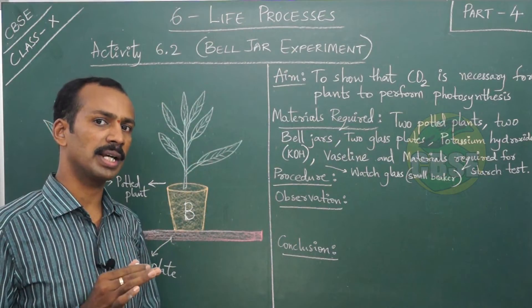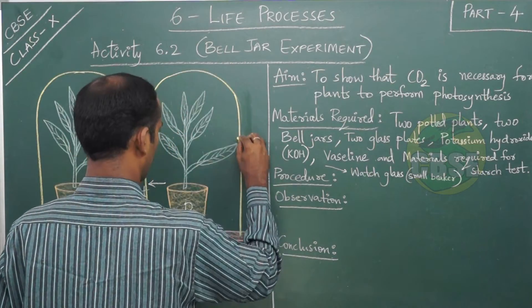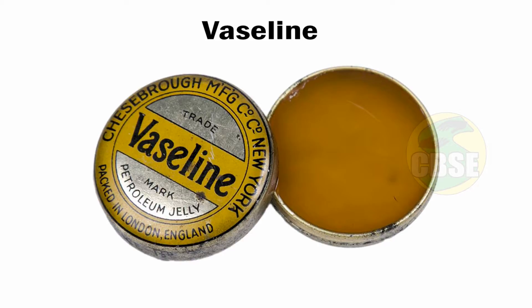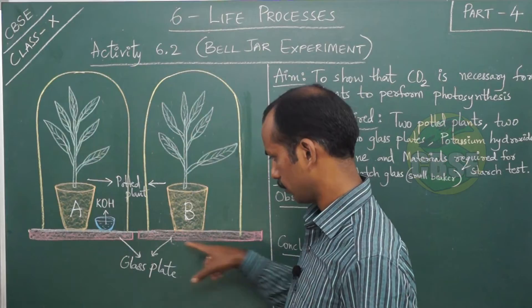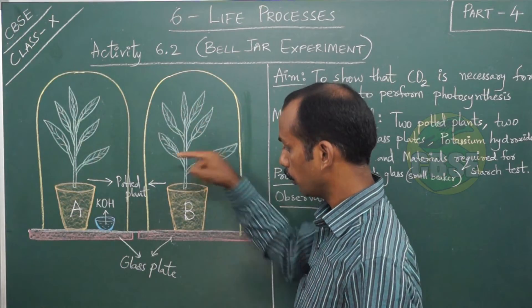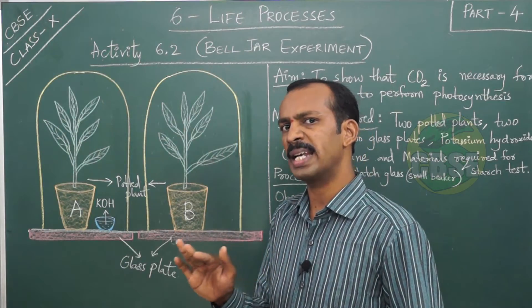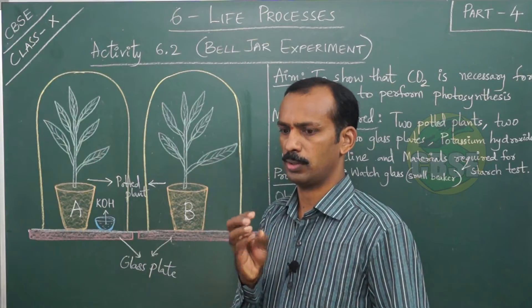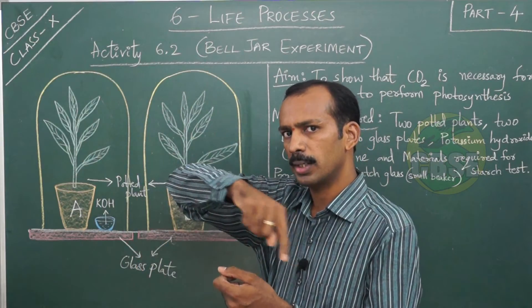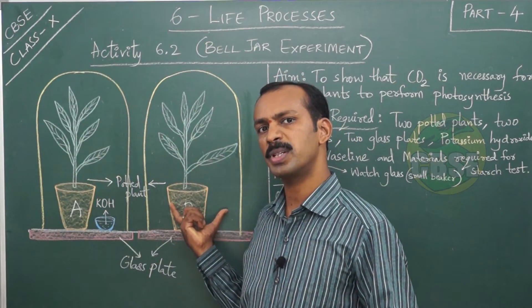We are covering bell jars on both the potted plants — bell jar A and bell jar B. We placed a glass plate under each potted plant. Between the bell jar and the glass plate there should not be any gap. A slight gap could allow air to enter or exit, so to fill that gap we are sealing the base of the bell jar with vaseline.